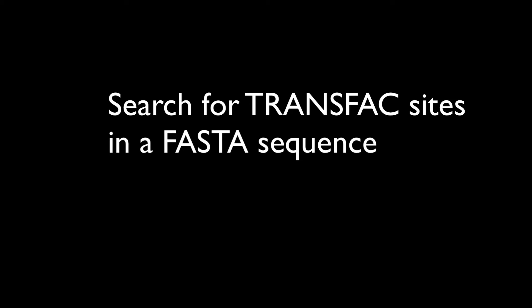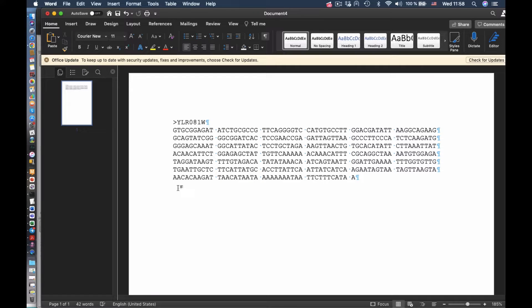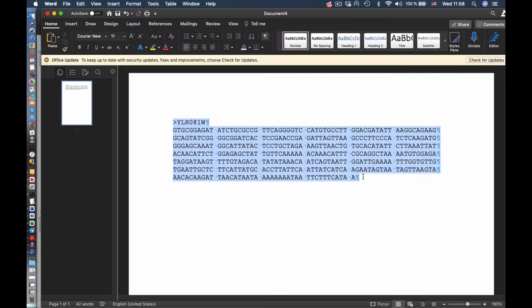Today we will learn how to search for transfac sites in FASTA sequences. Here is a FASTA sequence. As an example, we took a FASTA file of a promoter of GAL2 gene.